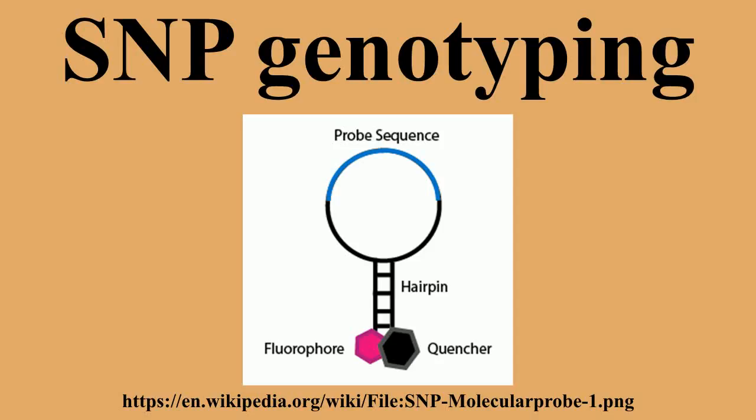The two primer pairs are also designed such that the PCR products are of a significantly different length, allowing for easily distinguishable bands by gel electrophoresis or melt temperature analysis.